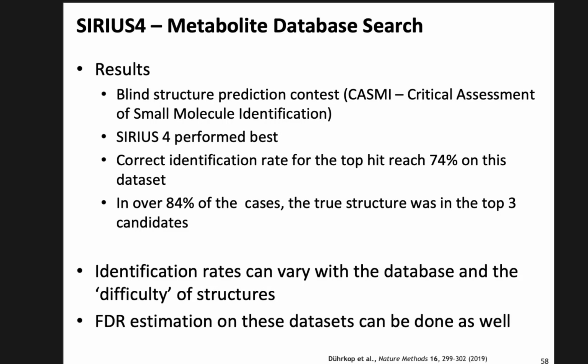And that has been held for a couple of years, where you release mass spectra of a compound, and you make sure that it's not in one of the databases, and you don't tell anybody what it is, and just ask several leading groups in the field, tell us what you think this is. It's never going to be a large data set. Someone has to synthesize these compounds, make sure that it really is what it is. So these tend to be 100, 200 compounds that are put into the competition.